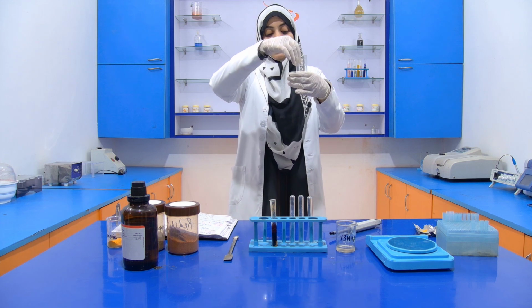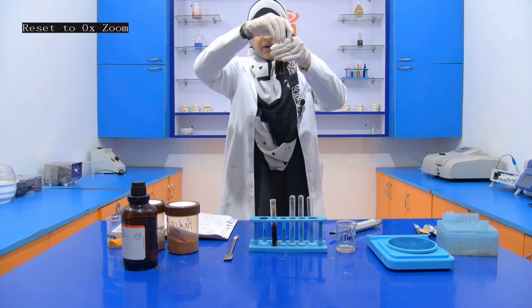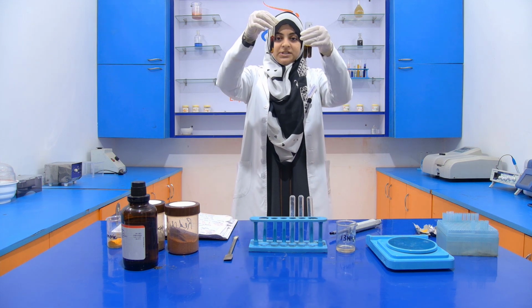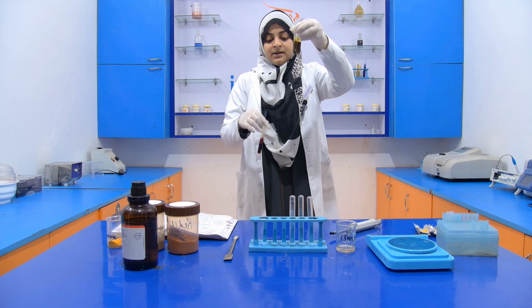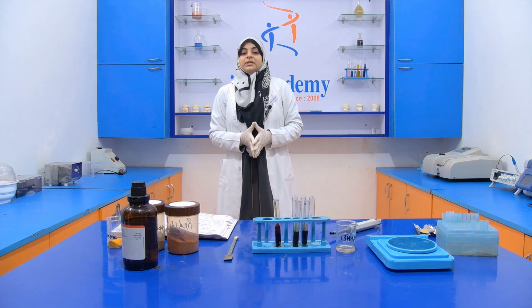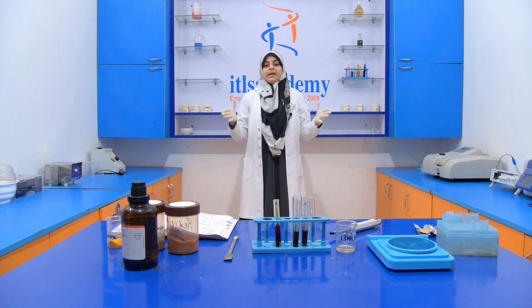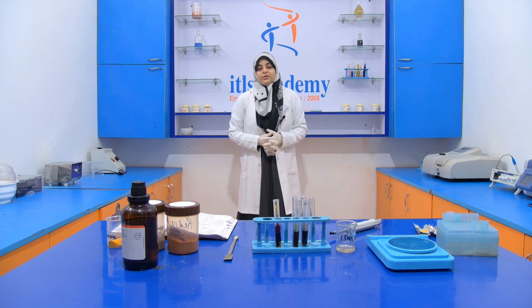So with red chili and black pepper we get a negative result, but with turmeric we get a positive result. Turmeric is positive, and black pepper and red chili powder are negative. So this is all about the detection of added color in turmeric, red chili and black pepper. This is all about today's experiment.